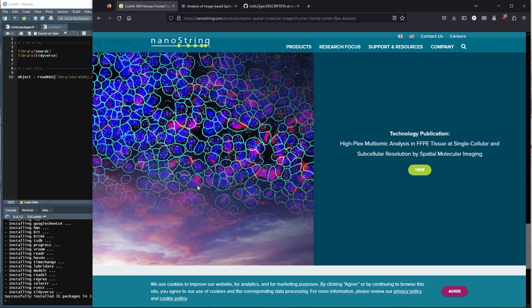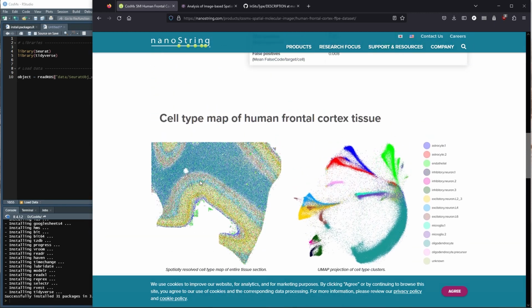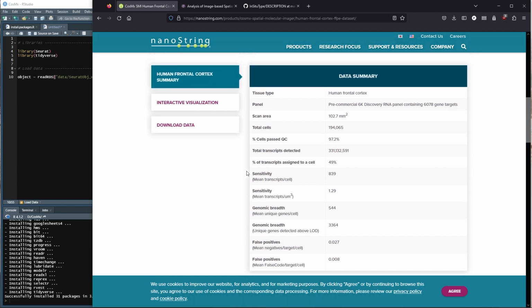They'll throw this away because they are unsure whether it's really one cell or two cells. If you get the raw data, you can go back through and actually look at those and see, okay, this is really one cell.